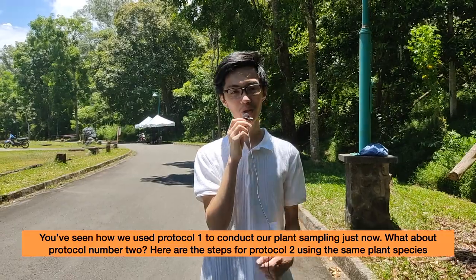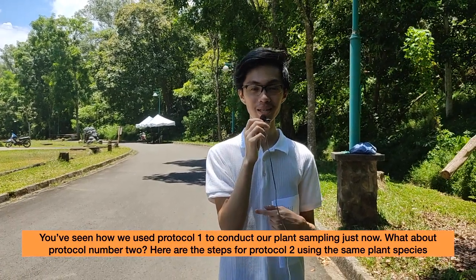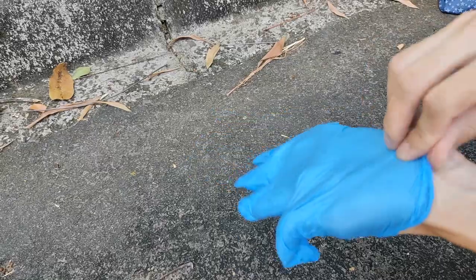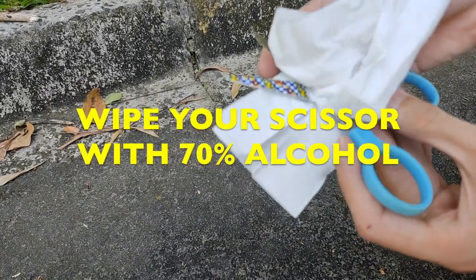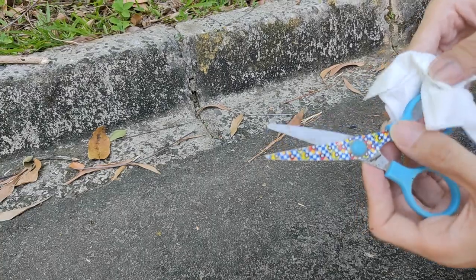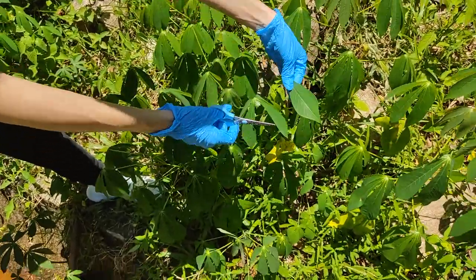This is because chemical defenses accumulate in older leaves. You've seen Protocol 1 for plant sampling — what about Protocol 2? Here are the steps for Protocol 2 using the same plant species. Make sure you wear your gloves, and wipe your scissors with 70% alcohol to prevent any cross-contamination of DNA during leaf sampling.